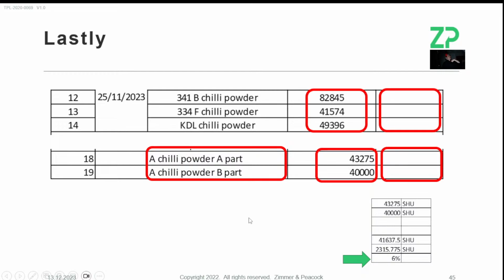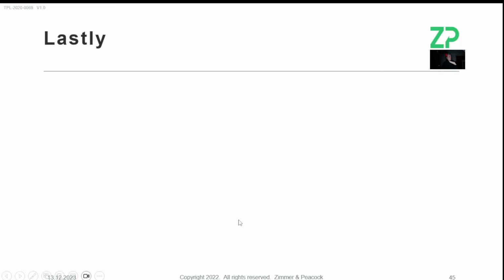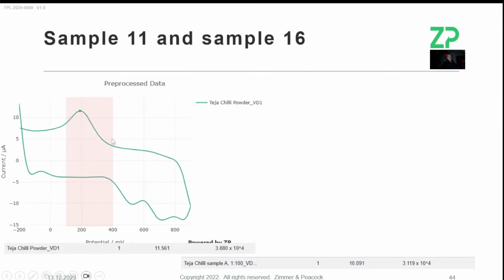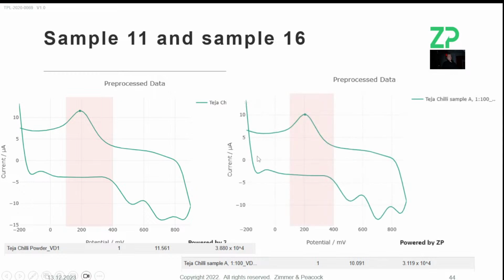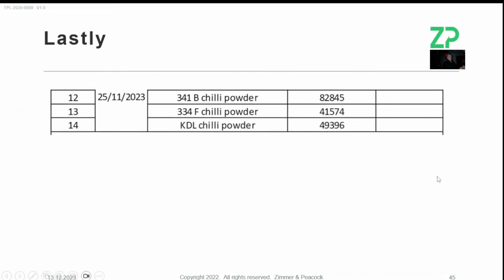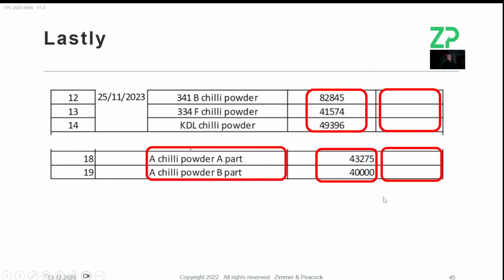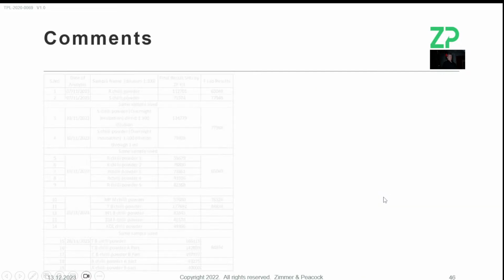Your comparison with HPLC, you're doubting it. But I would actually say the strongest case is probably on that TB, where FoodSense says it's very hot. The HPLC says it's only 84. Sorry, there's one sample, there's the other one. It's huge numbers. So I suspect that the HPLC you're blinded on, and you've no sense of error on that HPLC result, let's say. But your testing is actually starting to be really quite consistent on the FoodSense.